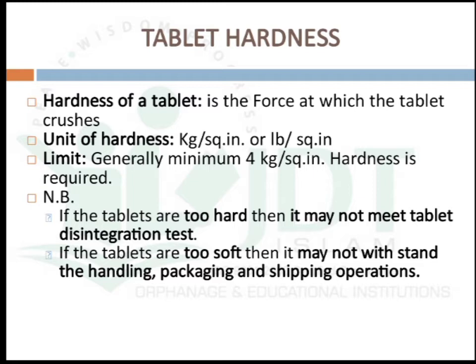If the tablet hardness is too high, it may not meet the tablet disintegration test, which is an official test for the quality control of tablets, and also it will not release in the gastrointestinal tract. And if the tablet is too soft with a low hardness, it may not withstand the handling, packaging and shipping operations.